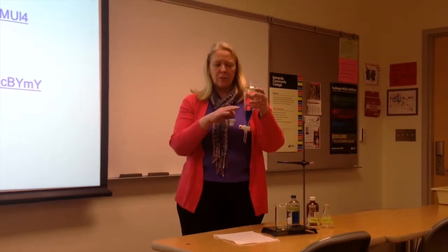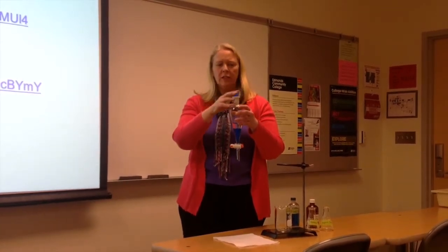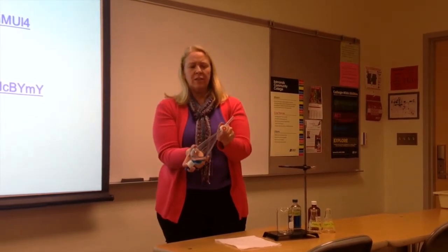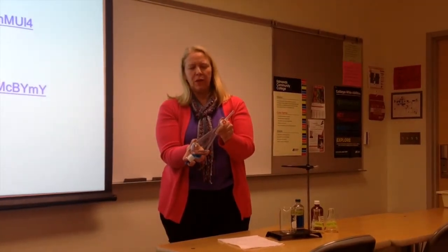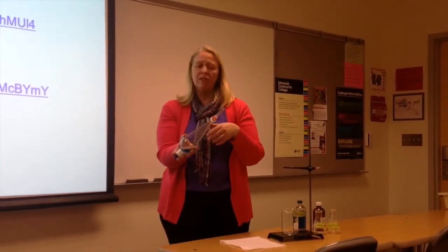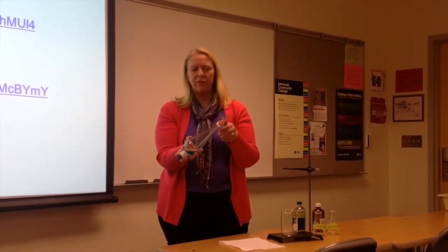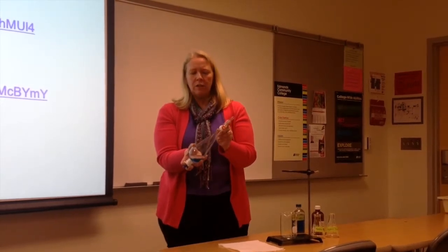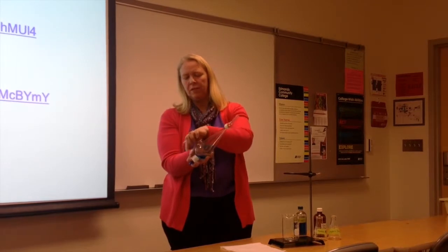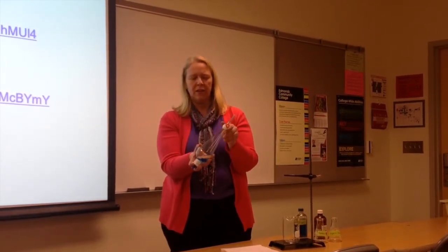So to do the extraction, we will need to mix those. So the first thing you're going to do is place the stopper on there, invert, and then you're going to vent. So this is important. You probably didn't hear the hiss, but a lot of the organic solvents are volatile, so they build up pressure if you shake them too much. So you want to release pressure. Make sure you also have your finger on the stopper so it doesn't slide out.